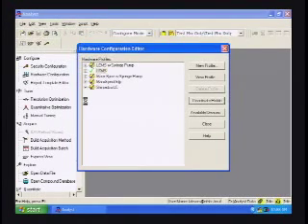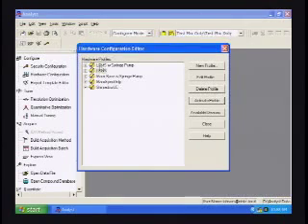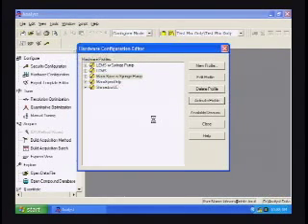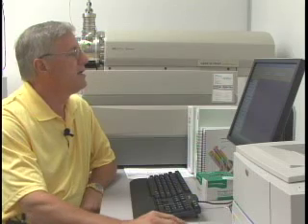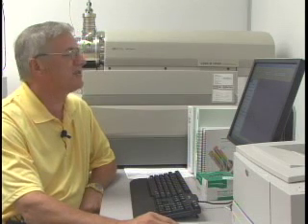Deactivation is performed simply by clicking on the deactivation. You can select a different profile — for example, if you wish to introduce a sample with a syringe pump, this particular profile can be selected, activated, and then your experiment performed using that particular profile. The report template editor simply allows you to print a report with different information at different places on the page, and that can be custom made based on what type of report you want.